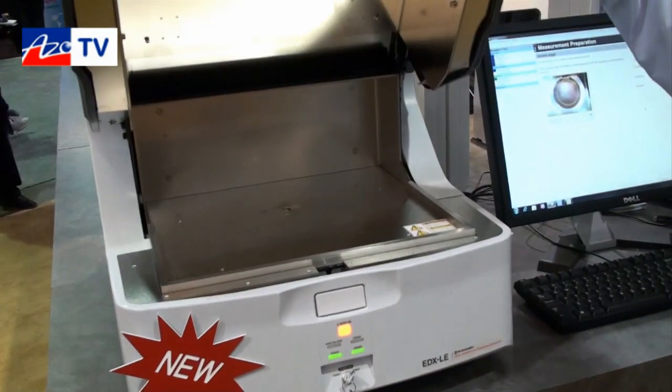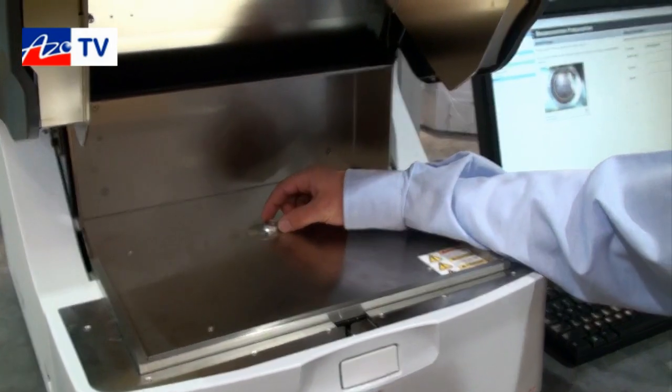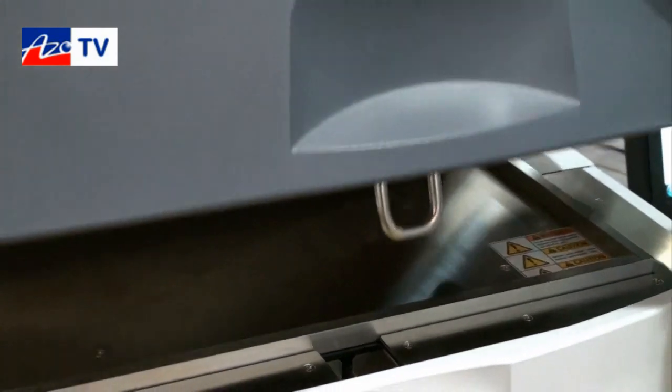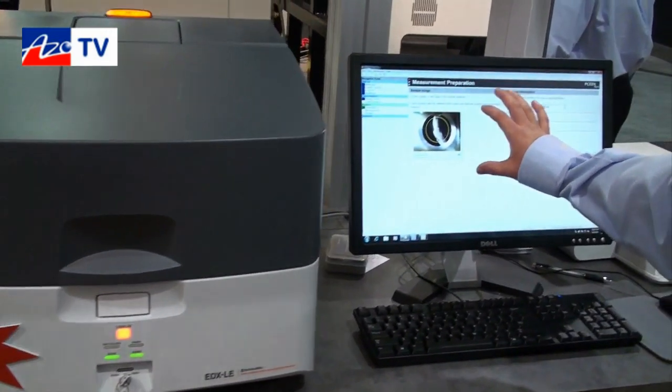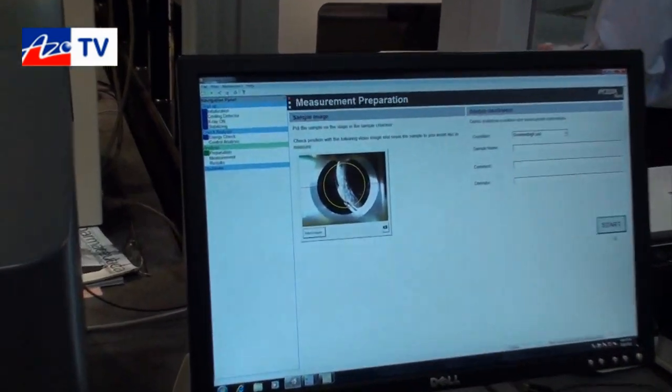This is the sample chamber where we actually put the sample in. For example, I'll use my ring as an analysis. We simply place the sample in there, and we have some positioning cameras here to help us position the sample in the center of the X-ray beam, and then we just start the analysis.